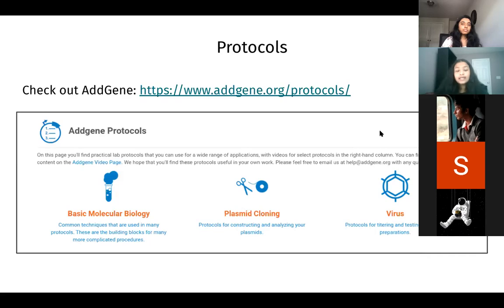Okay, and one last thing. Throughout this process, a really great website is Addgene. They have protocols for everything we have talked about and more. They have helpful videos and step-by-step instructions. So when you are doing your own restriction enzyme cloning workflow, definitely check out this website. It is very, very helpful. Yeah, so definitely check that out. It's called Addgene.